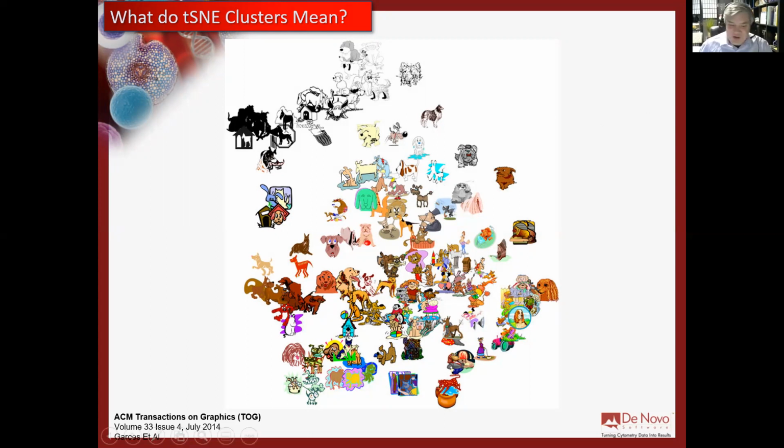because this algorithm was fed these images of dogs, and it was probably getting information out about the size, the shape, the colors, the pixels in these things. And the algorithm started segregating these little clip art pictures into clusters. So there's a little cluster of dogs with mostly white backgrounds, dogs with mostly black backgrounds, dogs with brown backgrounds. There's kind of colorful dogs. There's dogs over here that are kind of hand drawn looking, right? So there's a lot of different things going on here.